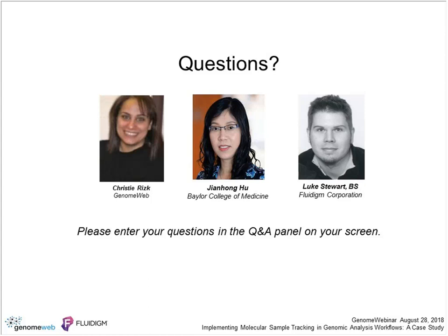Jianhong, how often is a failure due to poor sample quality? Are there any tips or guidelines you've implemented to help sample providers provide you with higher quality samples? So in our clinical lab, we have a requirement of sample quality. If the sample has low quality, we reject it. But for the research lab, we have to do a lot of samples, even with the samples with lower quality.